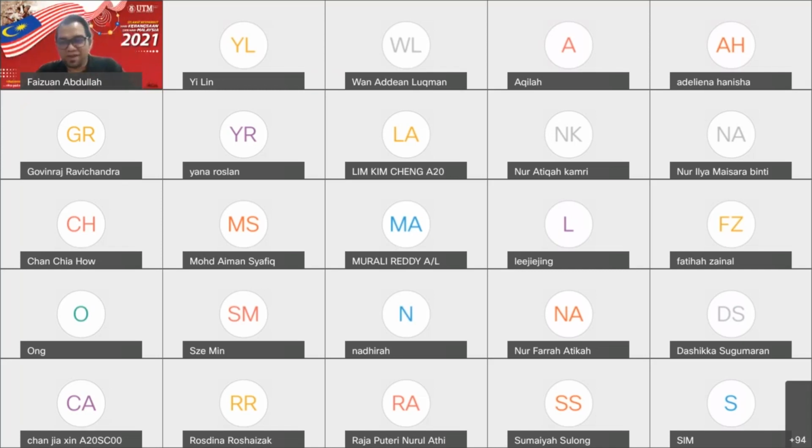We cannot use that to prepare the 0.1 ppm concentration of zinc solution from 1000 ppm. We cannot take 0.005 ml using that pipette. But why? Because of the volume of the pipette itself, right? Yes, Al-Zahra, thank you. It's a very small amount and the pipette is huge for it. How on earth can you take 0.005 ml? I should give you some respect if you can do that. Of course, the amount is too small.